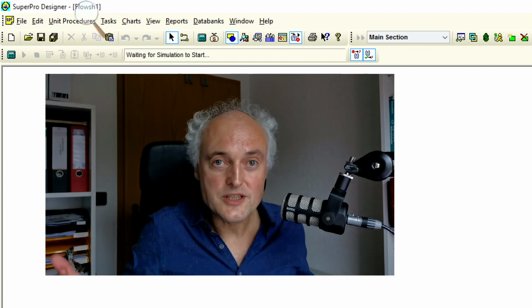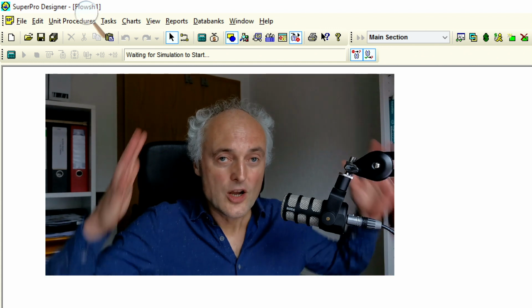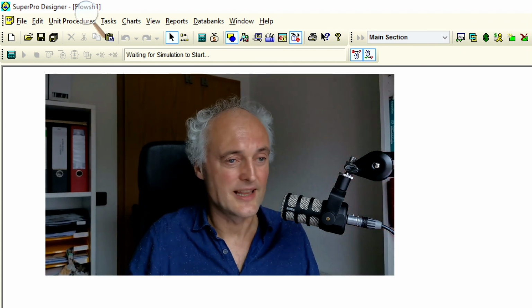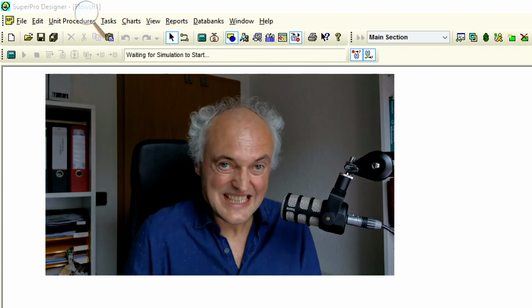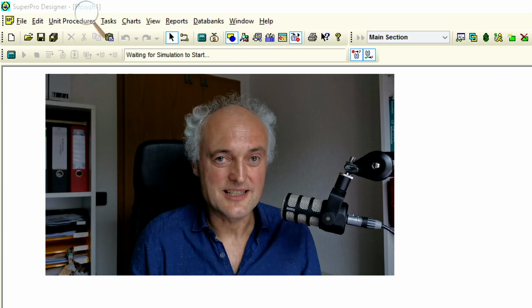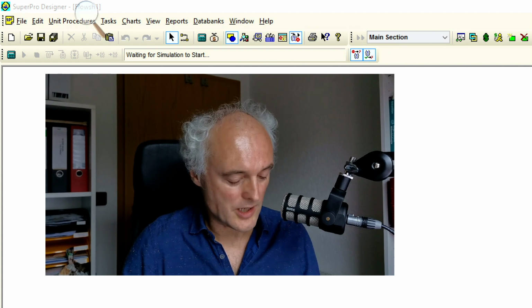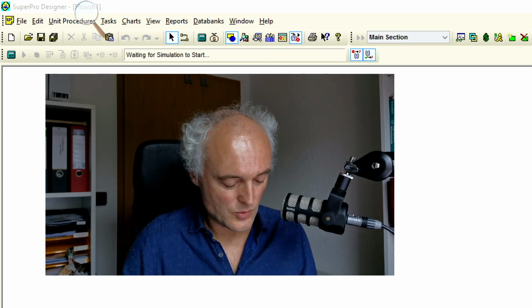So the first thing to do, if we start with a process, is to collect all substances we use in our process. If we want to put in substances, we need to initialize the substances in the software. So we need to initialize the pure substances. As described here, we go into tasks.